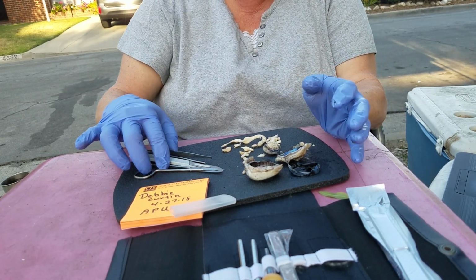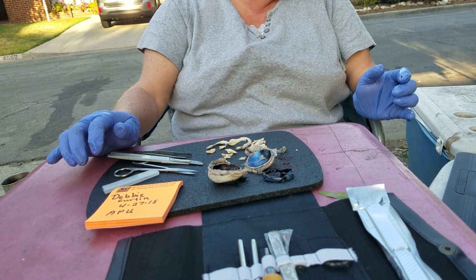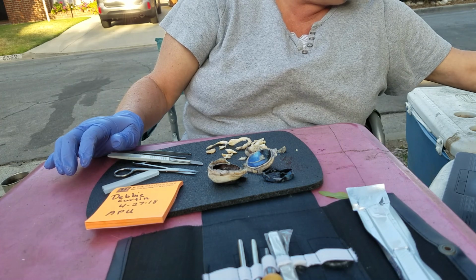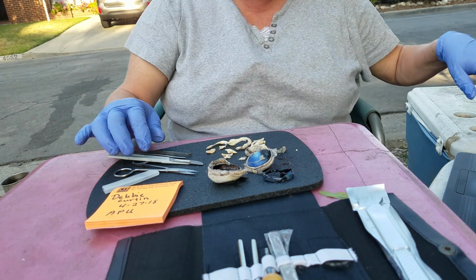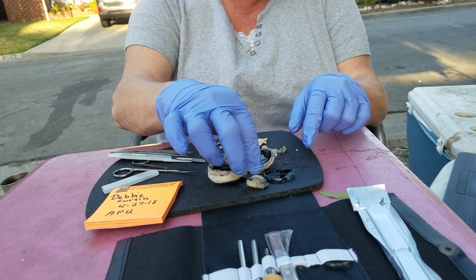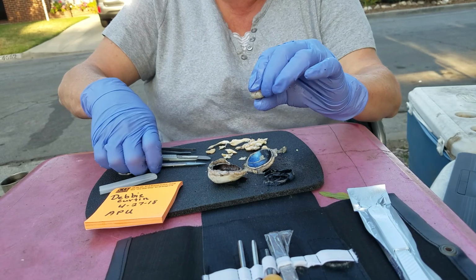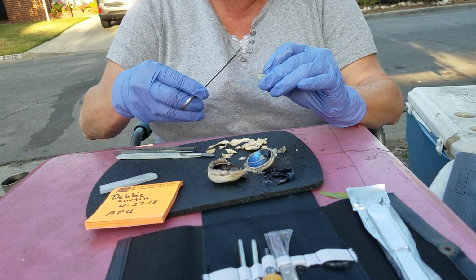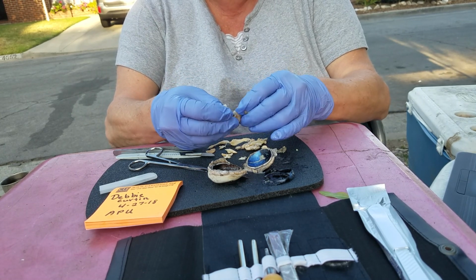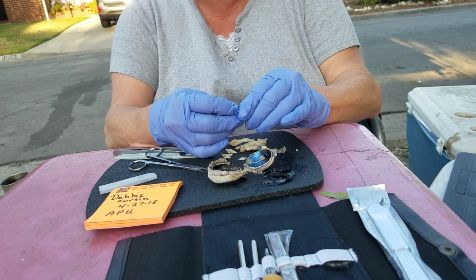So we're going to get a couple of pictures here now of the interior. We've already removed the vitreous portion of the eye, which is here. Like I said, it's very hard. It should have been a little more gelatinous. Let's see what happens if we try to cut off some of this tissue. I'm able to remove some of this fatty tissue. And inside we're finding a very hard ball-like substance.